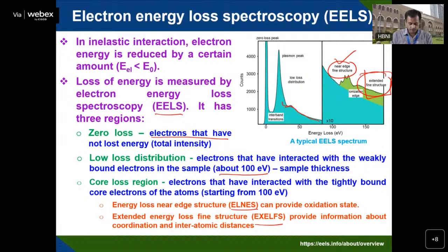I'll not discuss more detail about ELNES and EXELFS. I've discussed it in more detail in the case of X-ray. So mostly it is similar to that EXAFS and XANES properties. So you can see this is an EELS spectrum.